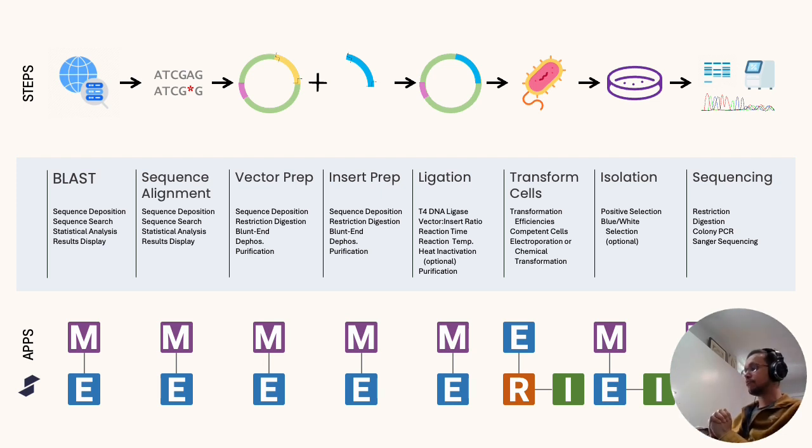We can even capture information on these cell lines, these bacterial colonies, in inventory. And similarly, the same case for sequences where we have assay results being able to push back to RegMol as well. So this is not an exhaustive list again. This is simply a brief showcase of what existing apps we expect to work with Molbio. We will continue building upon this, expanding on this, and you can certainly see additional modules come into play over here to give you this complete workflow from end to end.